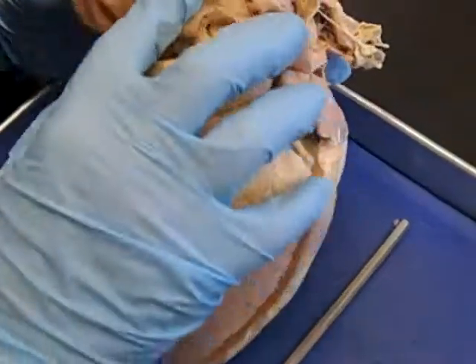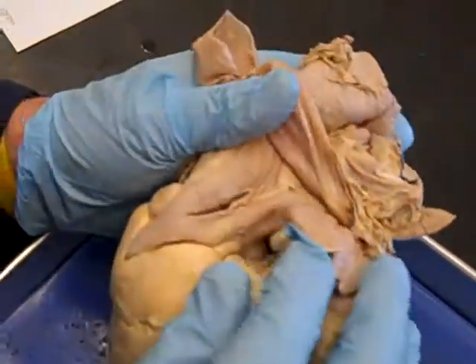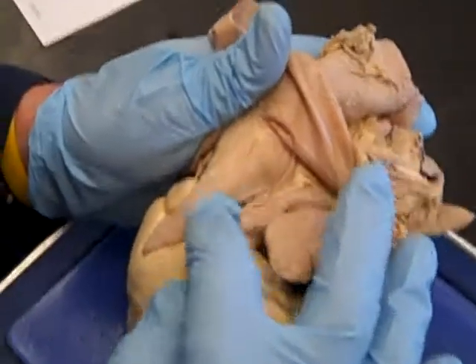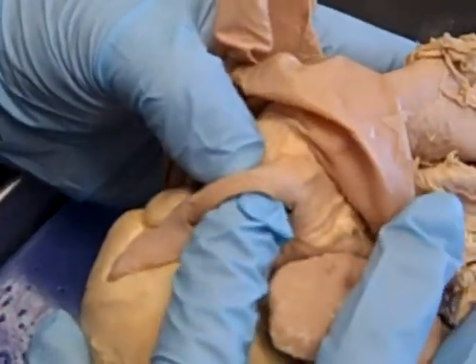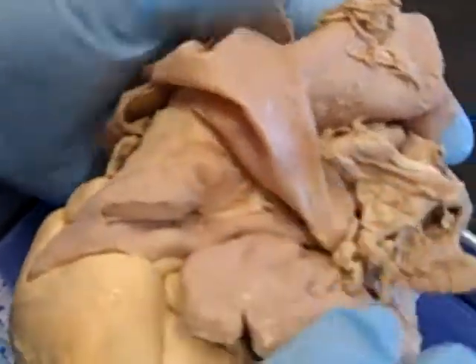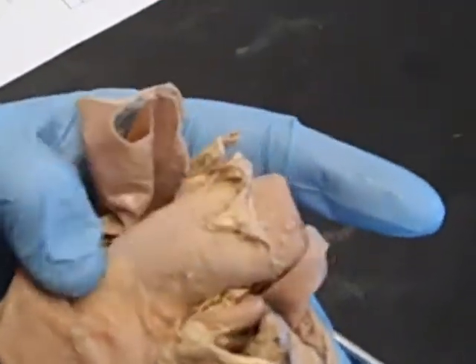Another clue for the ventral side is this large vessel right here — the pulmonary trunk. It's been cut open so we can see into it. The pulmonary trunk is an artery; you can see how thick the wall is. Dorsal to that is going to be the aorta.